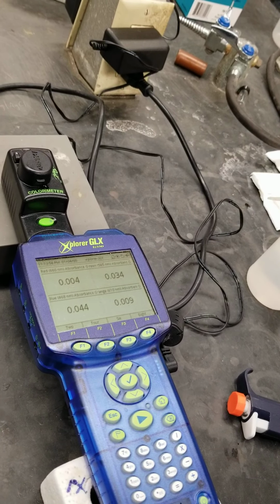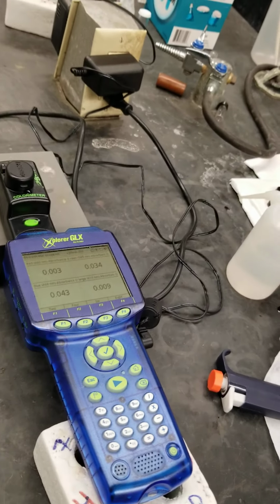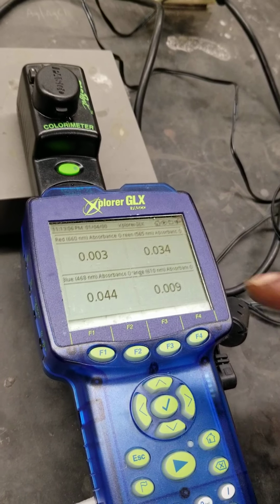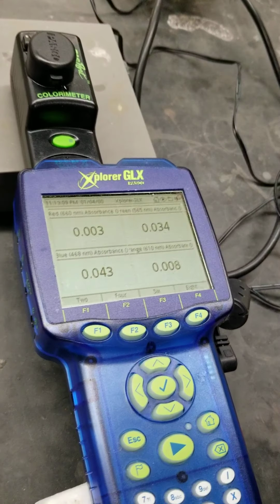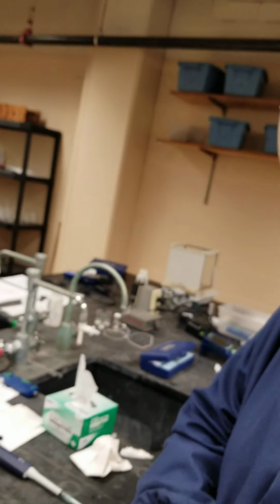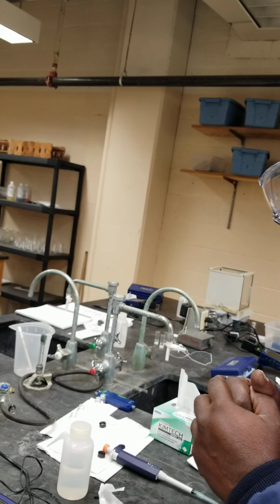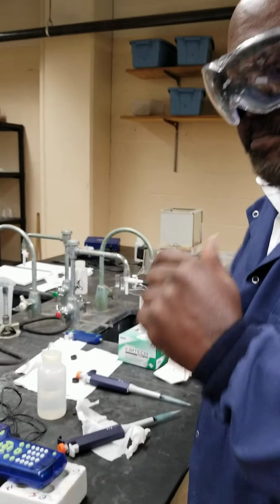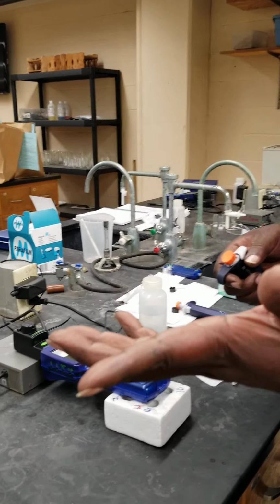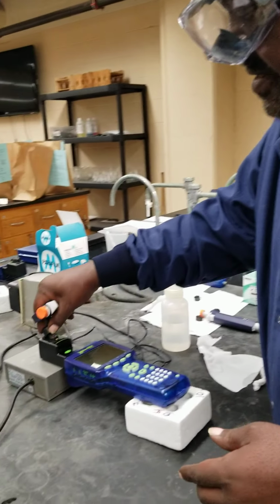And I'm going to look for the one that gives me the highest absorbance. Call that lambda max. And in this case it is 468 nanometers. My eyes are kind of weak, so I've got to use my head as eyes. So that's our absorbance when we add 0.1 milliliters. And we'll keep adding here until we add maybe 10, or when the absorbance comes close to 2.